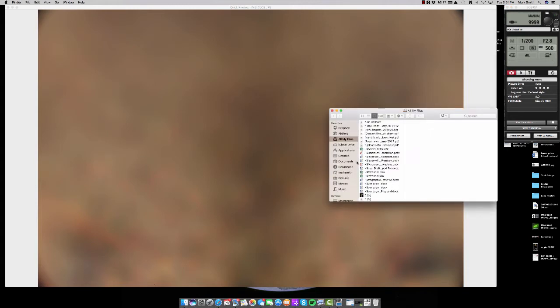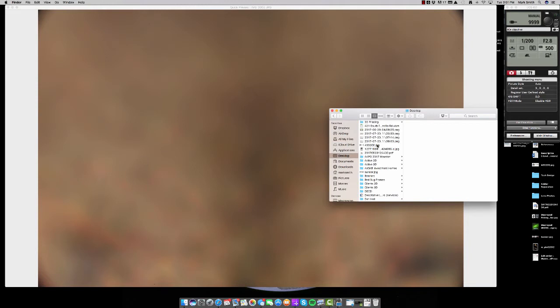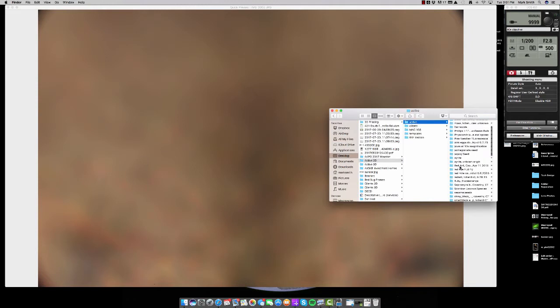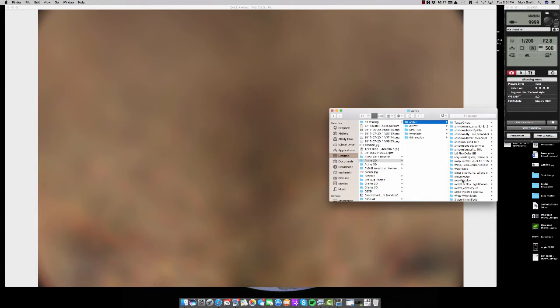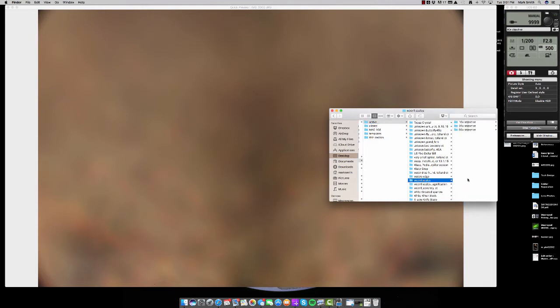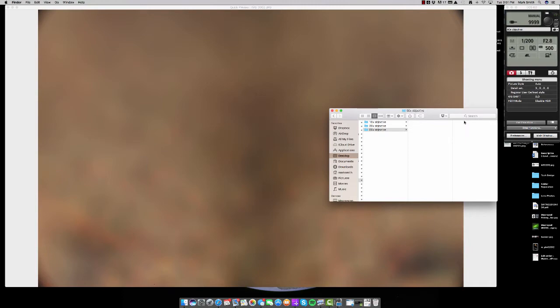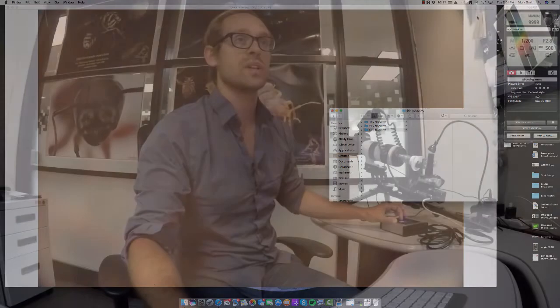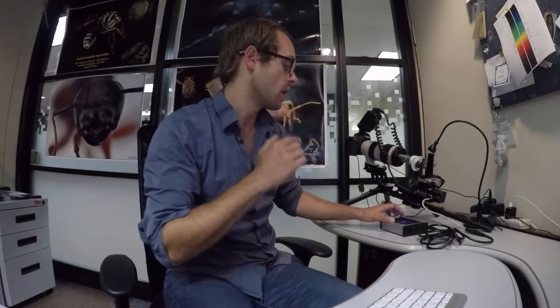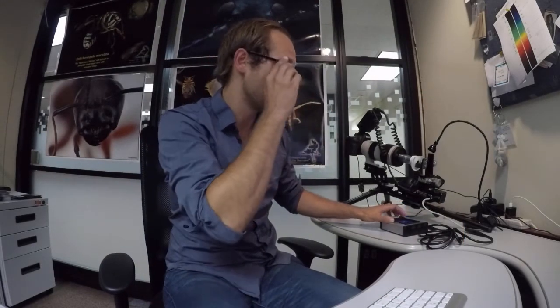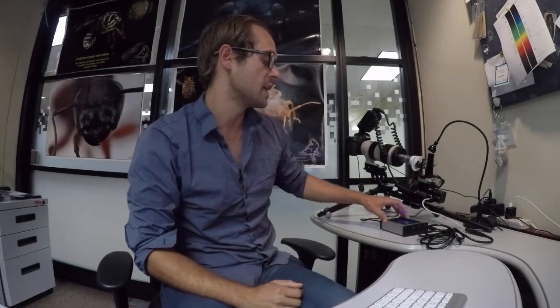With that, what we're going to do now is navigate to the active 2D folder where we have the 50X images stored and we're going to delete the test images we just captured. And now we're going to turn to our stack shot. We're going to press start.